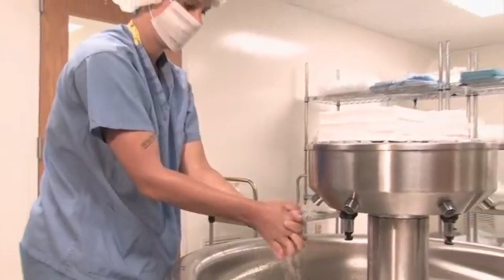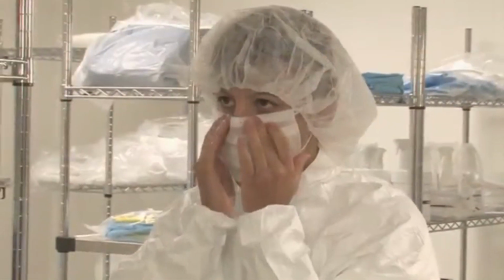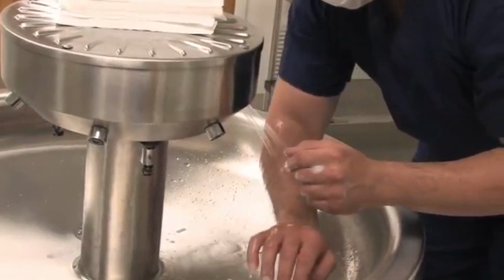The Ante room provides a clean area for hand washing and completing the final checklist of hair and shoe covers, gowns, gloves, and masks. The Ante room should include a hands-free sink, and compounding personnel must be able to enter the buffer area without the use of their hands.